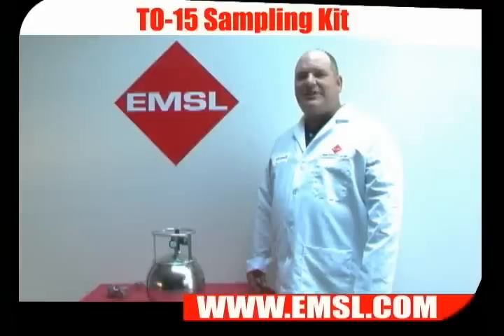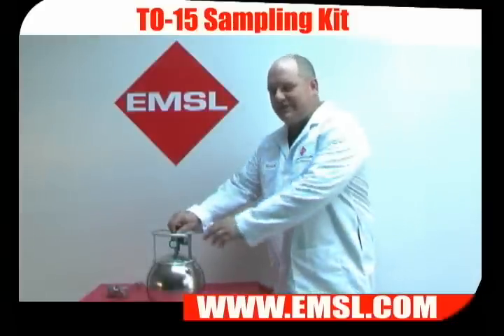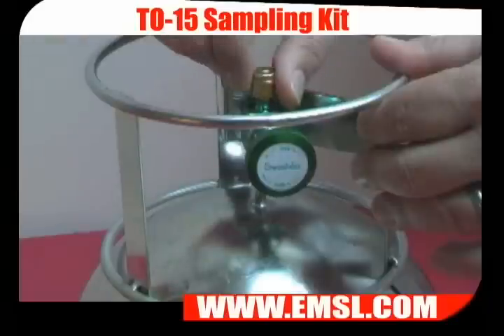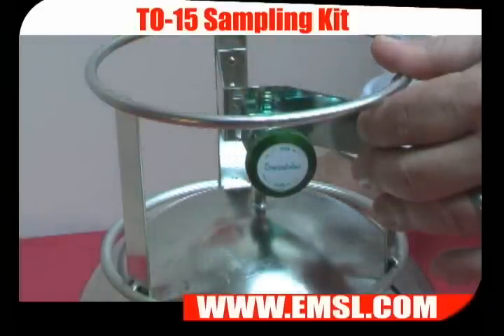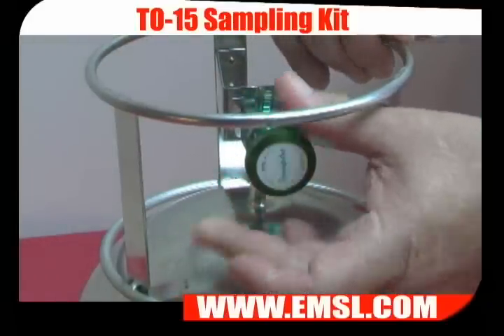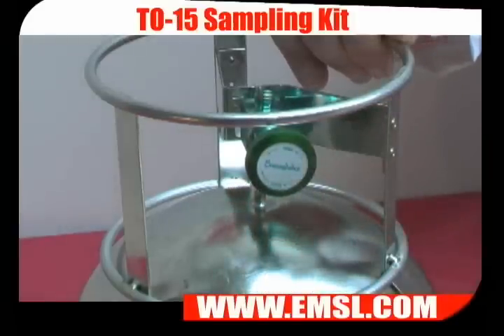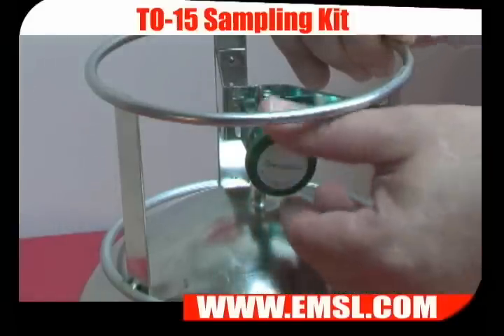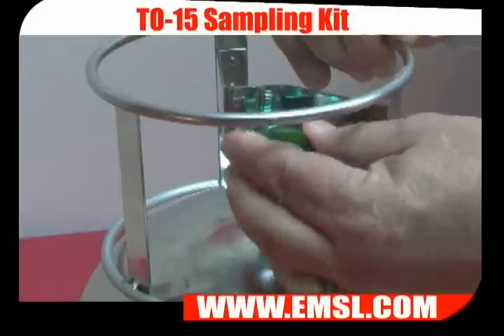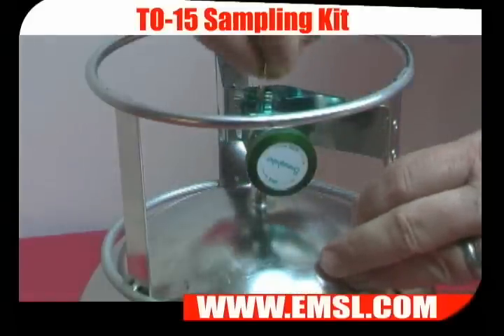Here's how to do a grab sample using a six-liter canister. First, remove the dust cap. Turn the valve counter-clockwise one full turn. When the hissing stops, close the valve and replace the dust cap.